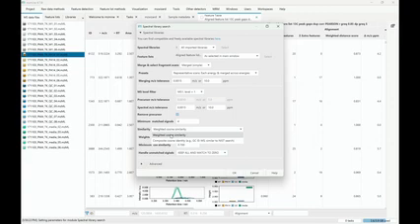Yeah. So we do implement many of these things. When we choose what to implement, especially for statistics, we chose the standard things where most people would agree, like the volcano plot, which is quite easy to use, and PCA also, and we try to make it more interactive. But we also think downstream tools are sometimes much more flexible, so even something like batch correction of intensities, sometimes people just want to do it in their R scripts and Python scripts. So I would say many people do it downstream.